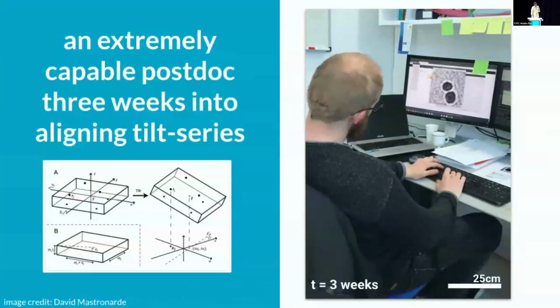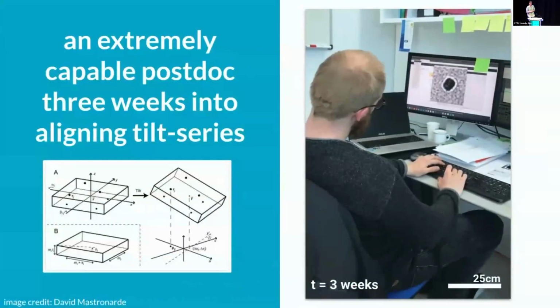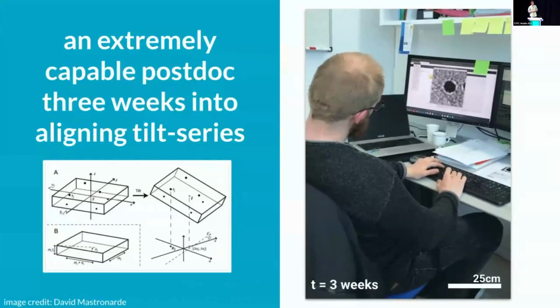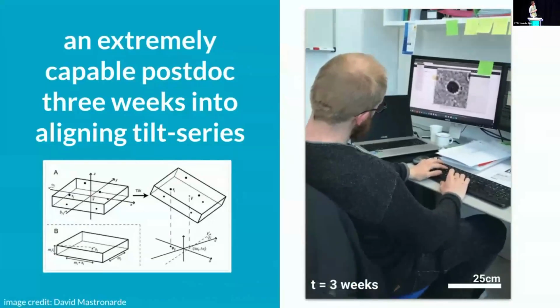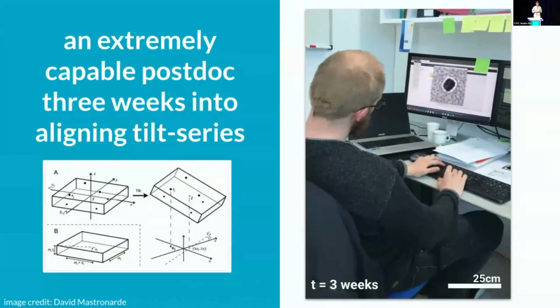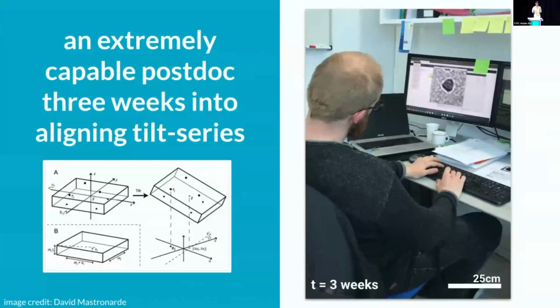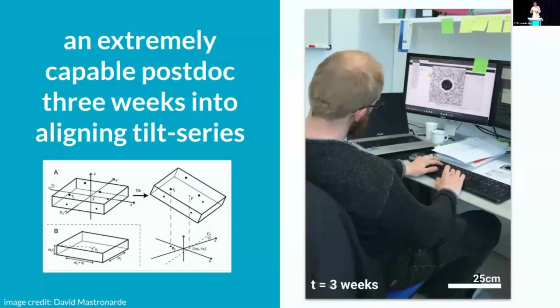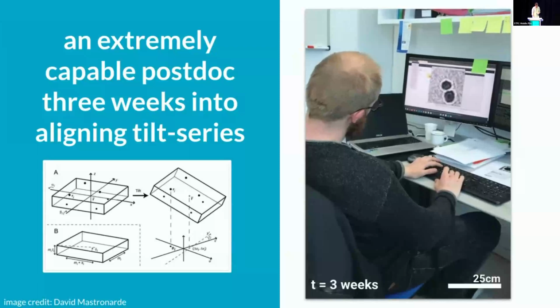Here is Jan from my PhD. He's a very capable postdoc, and we used to spend lots and lots of time making sure that these alignments were about as good as we possibly could get. Not many people spend as much time on this anymore. It maybe makes more difference than people think. We have nice push button solutions now. This is great, but I still see a lot of people not getting amazing results, and maybe they're not spending enough time here.